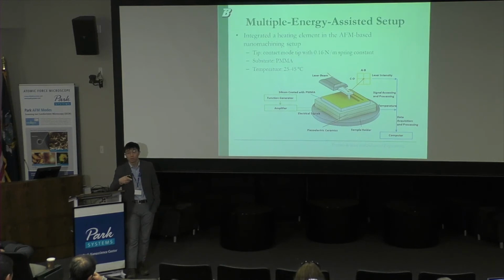And another thing is, if we use a high spring constant, the resolution of the force is very low, because the signal will just have the same signal, same laser. With a high spring constant, if we want to have a 10 nanometer difference, it's very hard. But with this one we can even achieve a few nanometer difference. So that gives us more resolution in terms of applying the force.